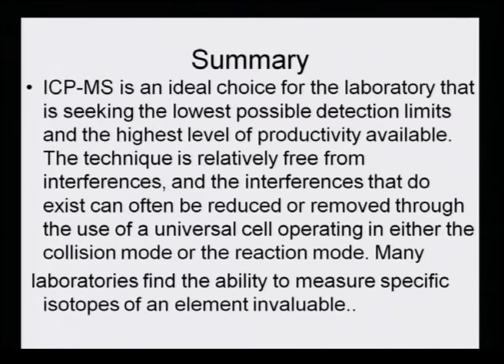Many laboratories find the ability to measure specific isotopes of an element invaluable. So, you see, it is such a useful machine that it is recommended that every laboratory should have an ICP-MS, because it not only has the lowest possible detection limit, but also the highest productivity limit. Any type of sample from any sphere of life can be analyzed very efficiently.